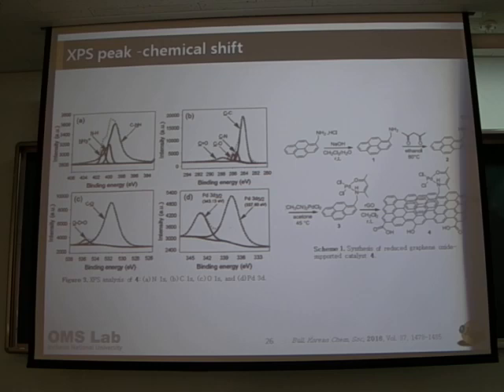그래? 그 얘기 아니잖아. 지금 how that amine gets this proton? 얘가 if we don't treat this acid, then 아모늄이 나올 수 있는 건가? 그걸 보여주는 거 아니야? The surface contains the amine. If the compound contains amine, then XPS peak normally shows this one. 지금 아모늄 피크가 원래 따로 나와. 잘 안 보여. 이건 다른 내용이지. 출발 물질에서 따라왔다는 거야? 아니면 얘가 코디네이션 된다면 이게 아모늄처럼 되니까 그게 보인다는 걸 얘기하나?